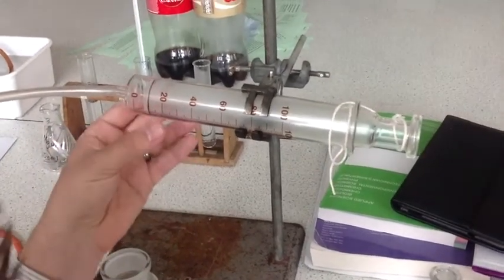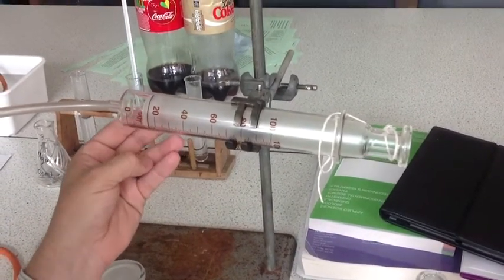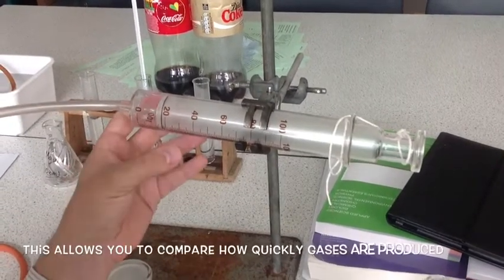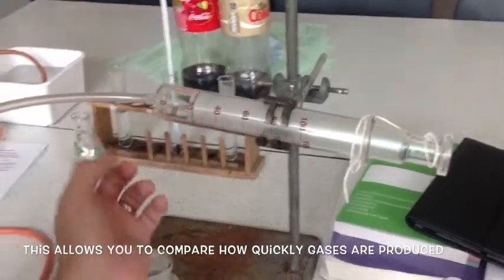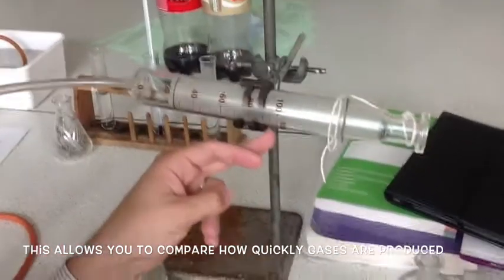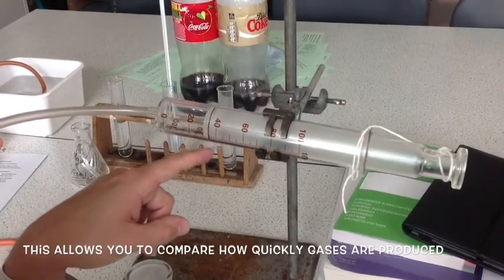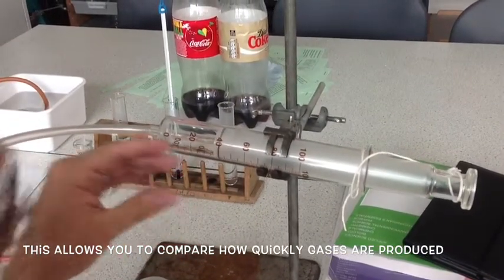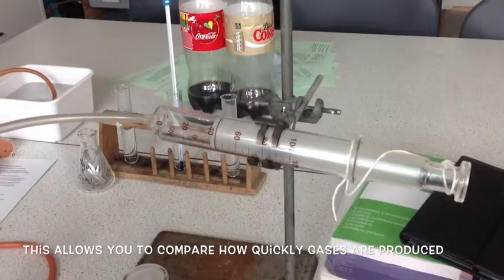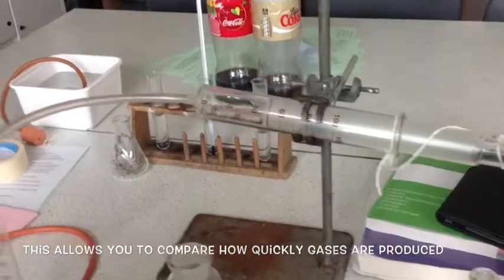So after 10 seconds, I have 12 mils of gas. After 20 seconds, I can look at it again and see what the measurement will be. And this time it's 20 mils of gas. And that can continue right the way up until I've produced 100 mils of gas. This allows me to see the rate. So at 30 I've got 30 mils of gas. It isn't always a 1-to-1 ratio. This allows me to see how quickly the gas is being produced and look at the rate of gas formation and look at how that rate changes as the reaction progresses through all the stages of reaction.